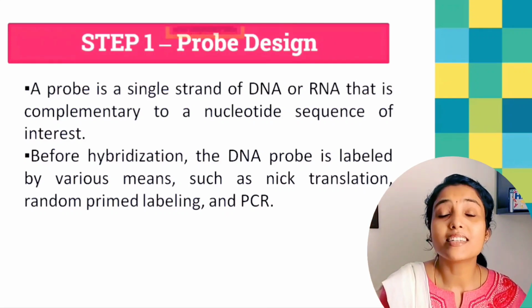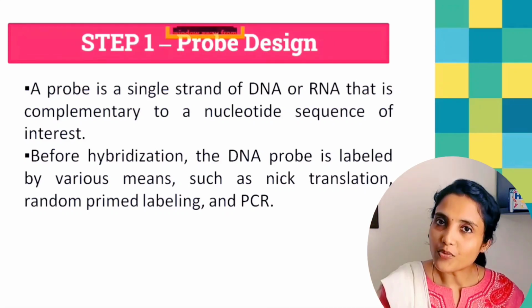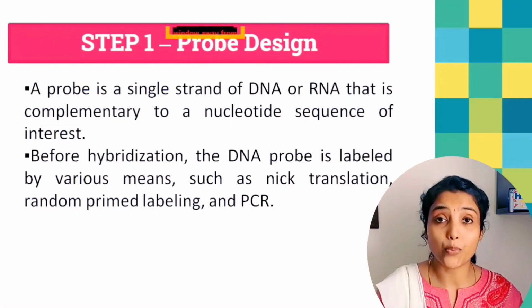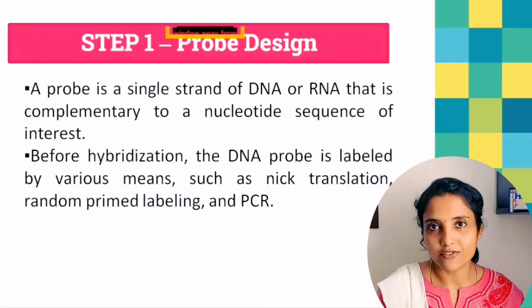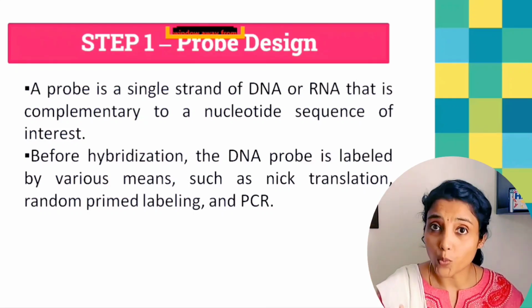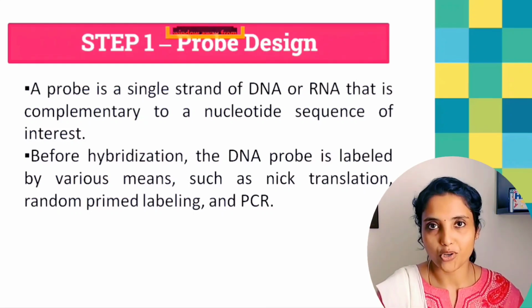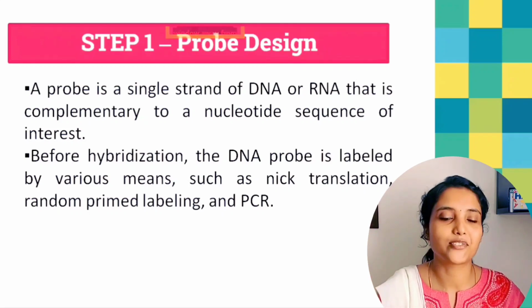So a probe is nothing but a single-stranded DNA or an RNA piece, okay? And that will be designed by us in such a way that it will be complementary to our sequence of interest. Whatever sequence we are targeting, it will be complementary to that. So probe is something that we design, okay? And remember, it has to be a single-stranded molecule. Only then it will go and hybridize with a single strand of our target sequence, okay?